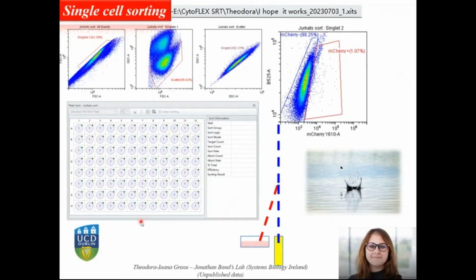But in this case, the team at Beckman Coulter decided to put in a new characteristic, which is called stream mode switch. What is a stream mode switch? So you click on this one, and it tells you to remove the waste container. If you remember when I showed you, the waste container has two different positions, one straight down, and the other one at an angle.